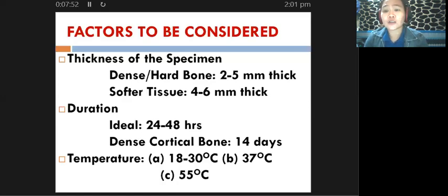Your tissue sample will also include the different cellular elements found together with the collagen, and the nuclear staining of those cellular elements is what is stained in your Van Gieson's. Also at 37 degrees Celsius, there will be a reduced effectiveness of your trichrome stain.